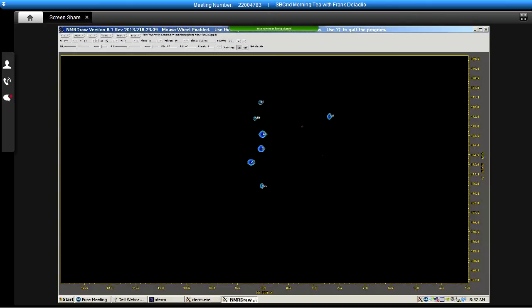And then finally, some of the peaks are labeled with an asterisk instead of a number. That means the peak detection program has decided that that peak is most likely due to either random noise or that peak is a truncation artifact of a nearby larger peak. For example, let's see. This small negative peak here is actually a truncation artifact of a larger peak in the next plane.